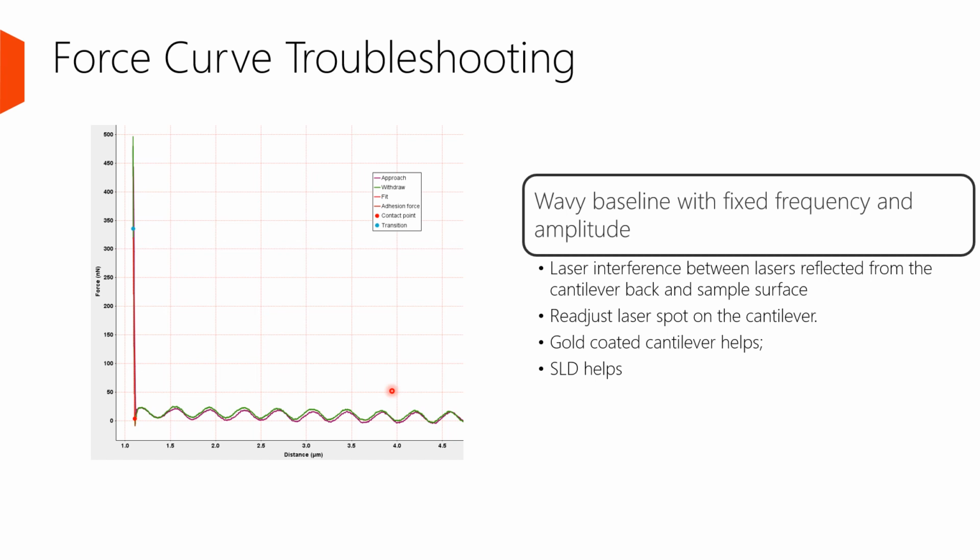Besides this, if we are using a gold-coated cantilever, it also helps. And if the laser source is SLD, it also helps.